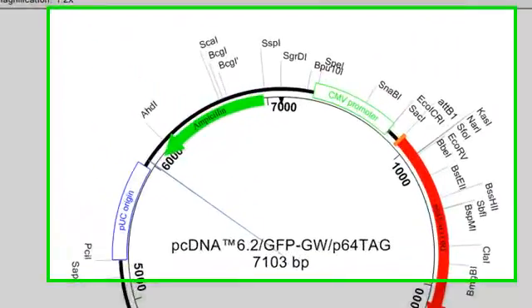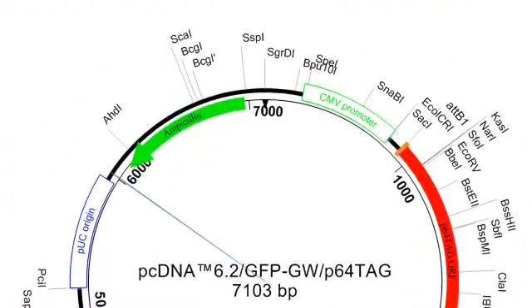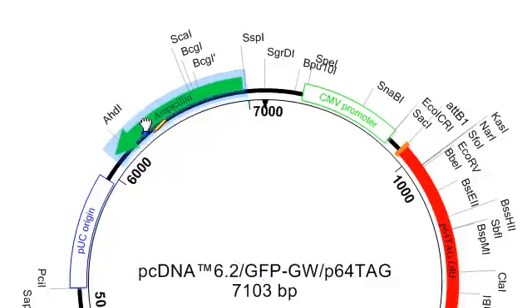One tip that I want to share is that you can move almost anything within the circular map or the linear map just by selecting the item you want to move and then dragging it to where you want it to be displayed. So, for example, I can select this feature here and then drag it in or outside of the ruler.